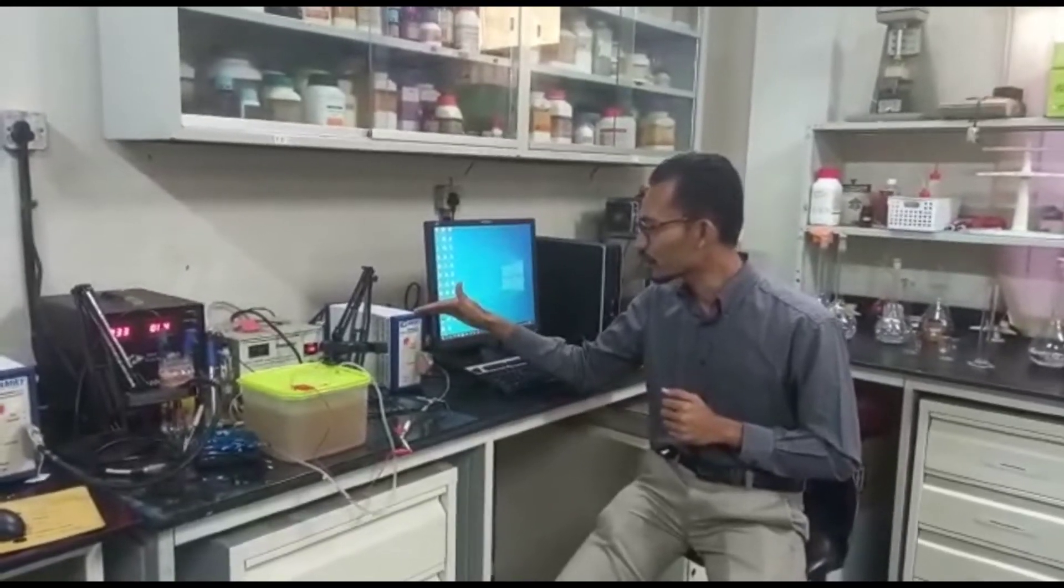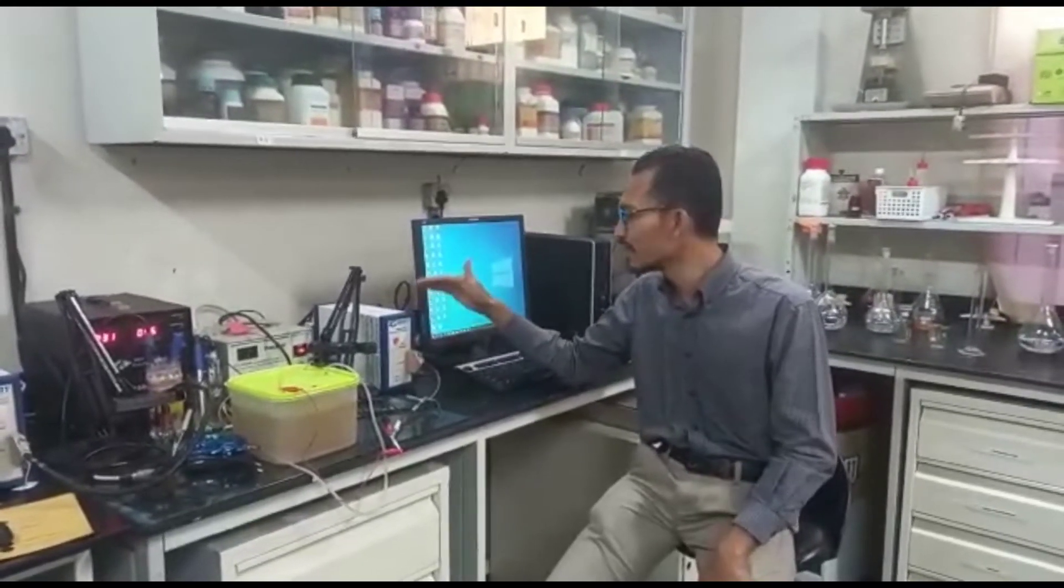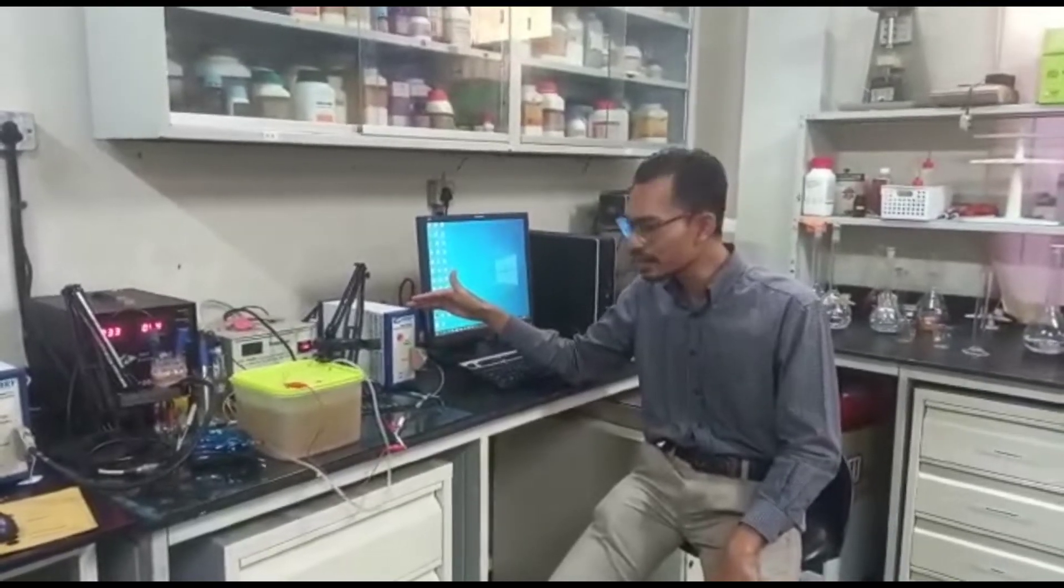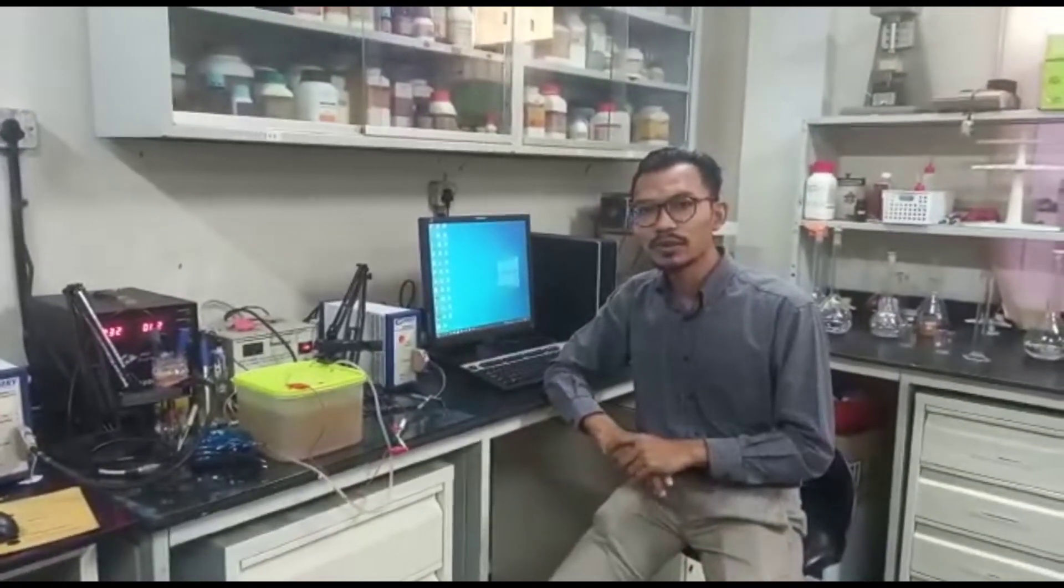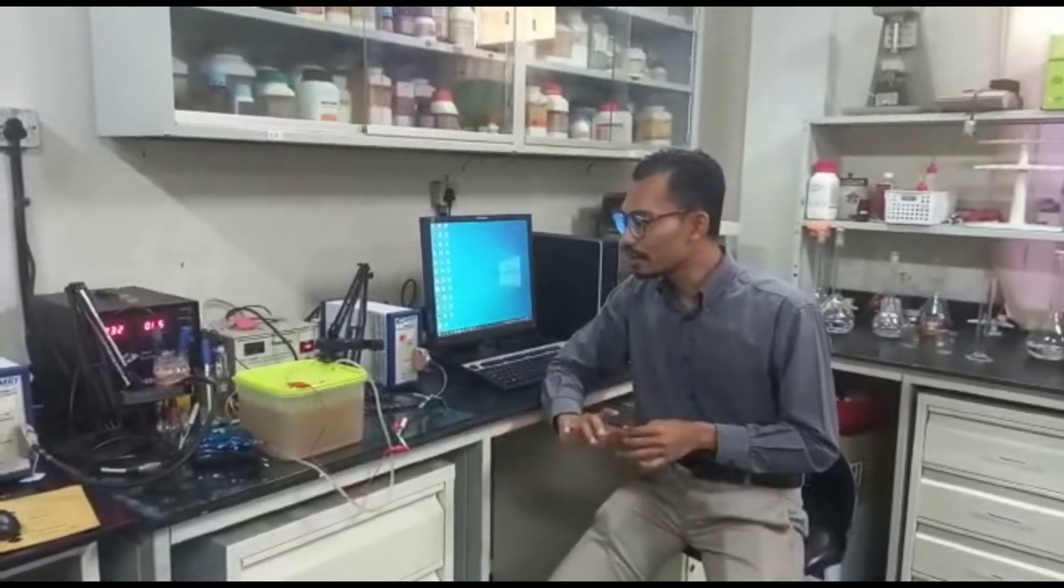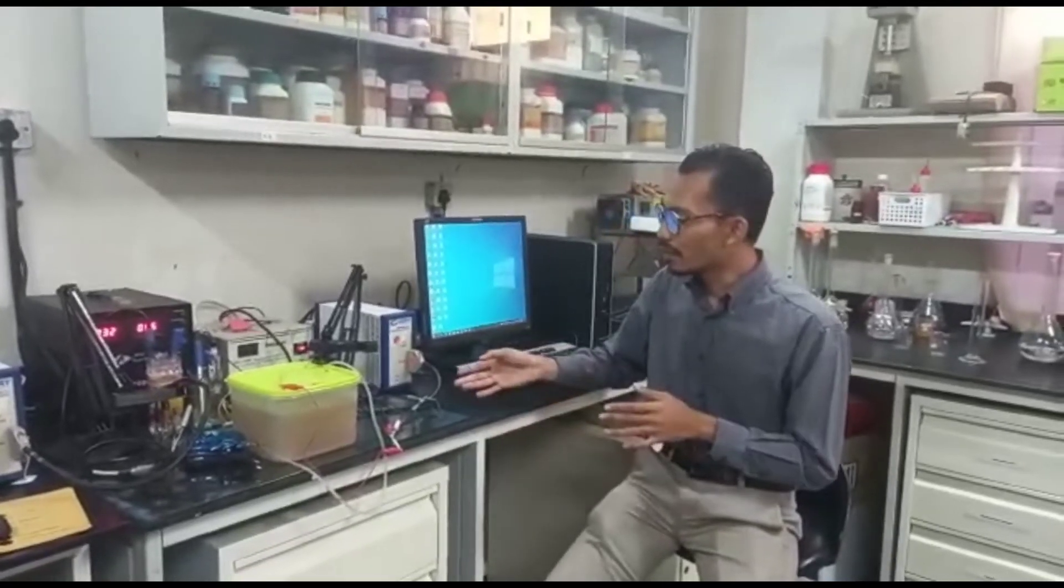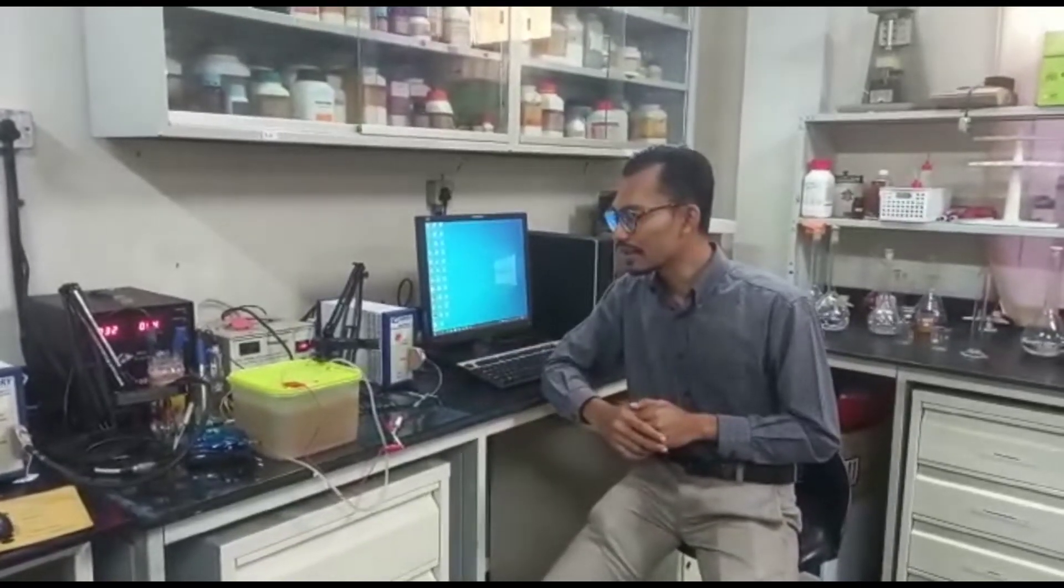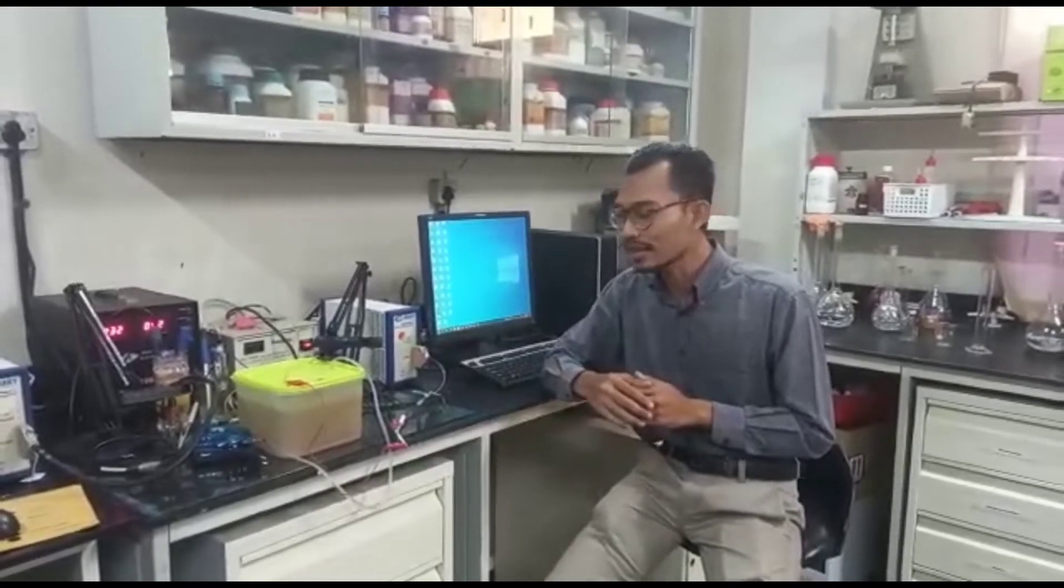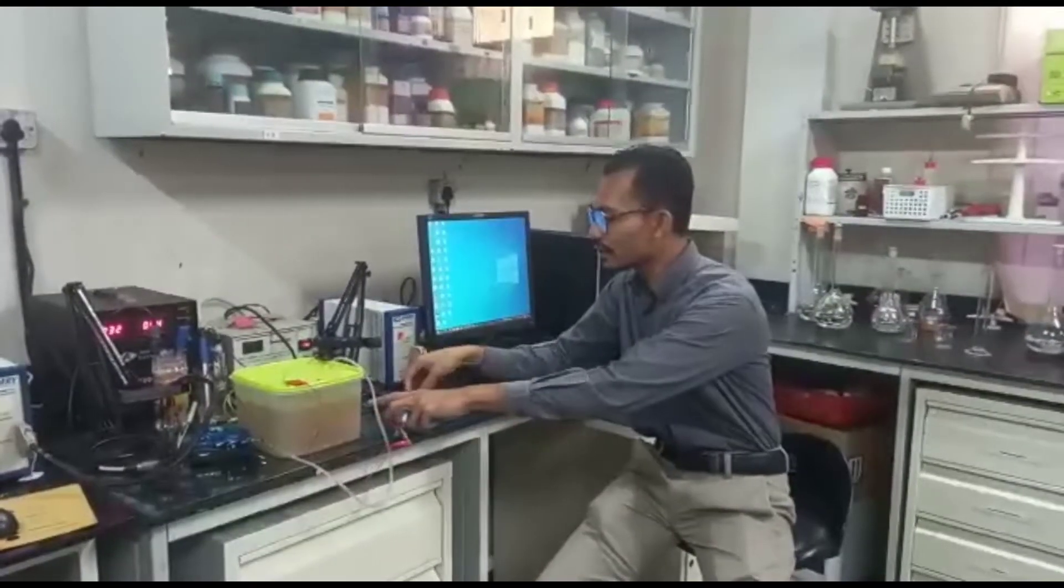And the type of potentiostat that we are using over here is actually Gamry Reference 600. And since we have like two electrodes and two terminals, it means that our clips need to be connected correctly.